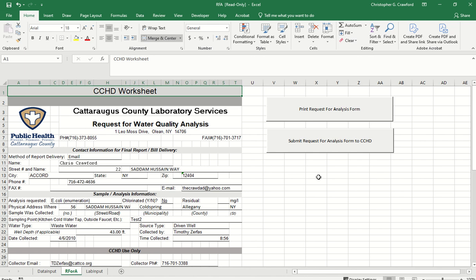because of how the path name is formed when you hit the submit button, it takes the client name, it takes the location name, and it takes the date. So if you collect two samples on the same date in the same location, same sample point, same date, same location, same client, in the past it would overwrite. Now it doesn't do that. Now it says, oh, we already have that file. You need to rename it. You need to give it a different location name or give it a different client name.